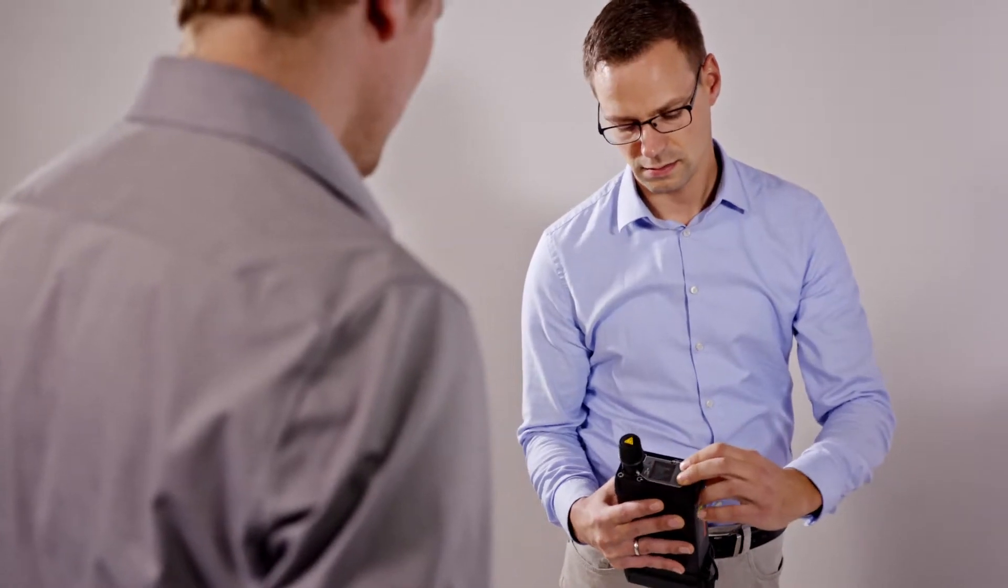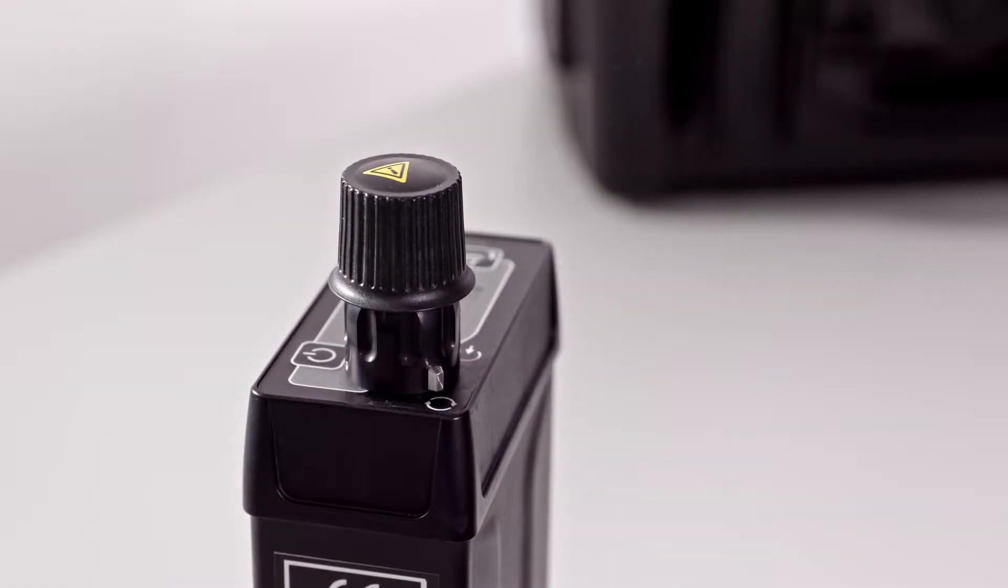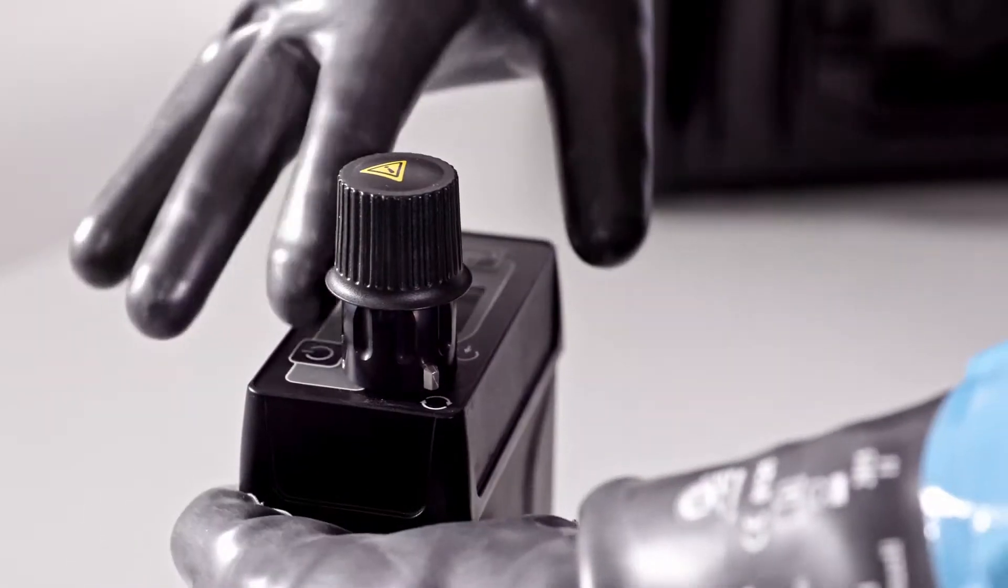The MicroRAID Plus is extremely easy to use. A normal operator can be comprehensively trained in less than one hour to operate the equipment and accessories.